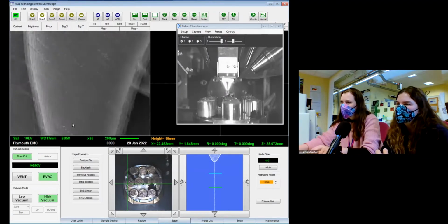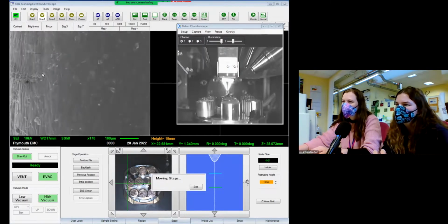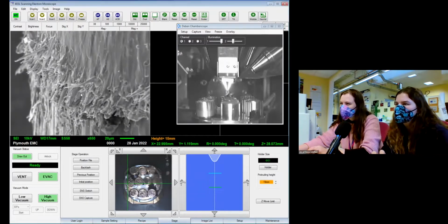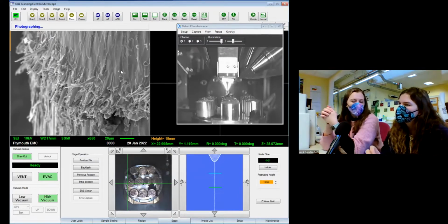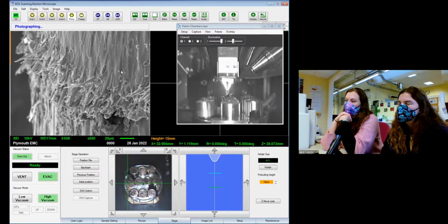Looks like a good bit, gets some good texture. But it was much rougher than I thought it would be. Ooh, this looks even more rough. I think that's all the main bits in focus, isn't it? Yeah, I think so. Wow. I guess I can kind of imagine it though, because when you break a nail, you can take the top couple of layers off. It's really cool. Surprised we haven't found more shedding of the claw. They do it for a month, every couple of months. Oh wow. Yeah, it's quite a regular thing.